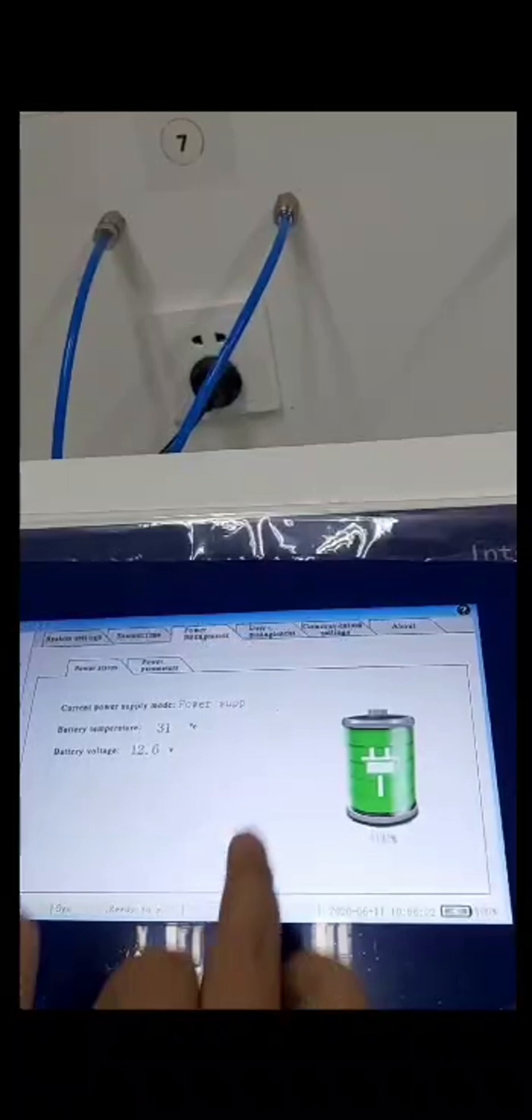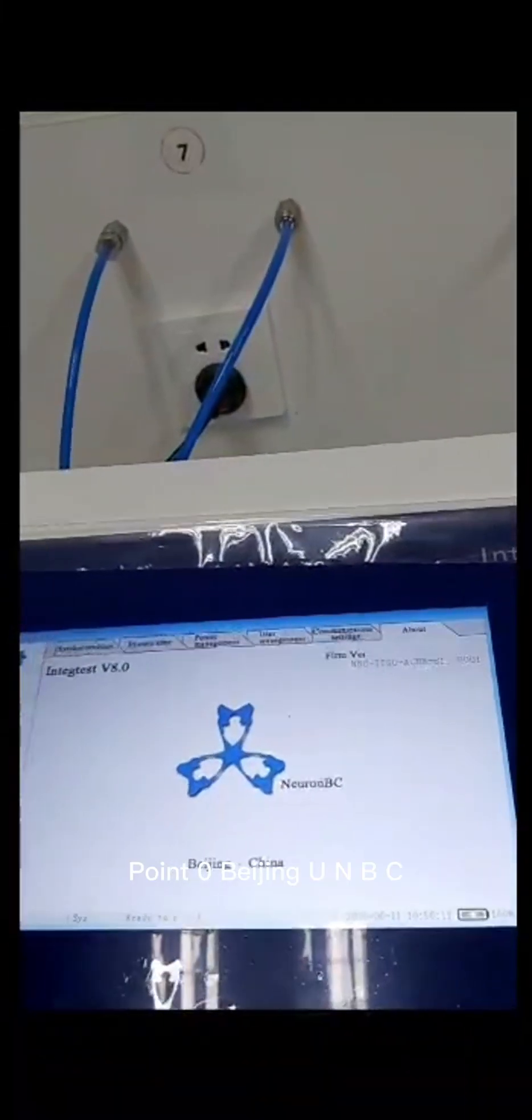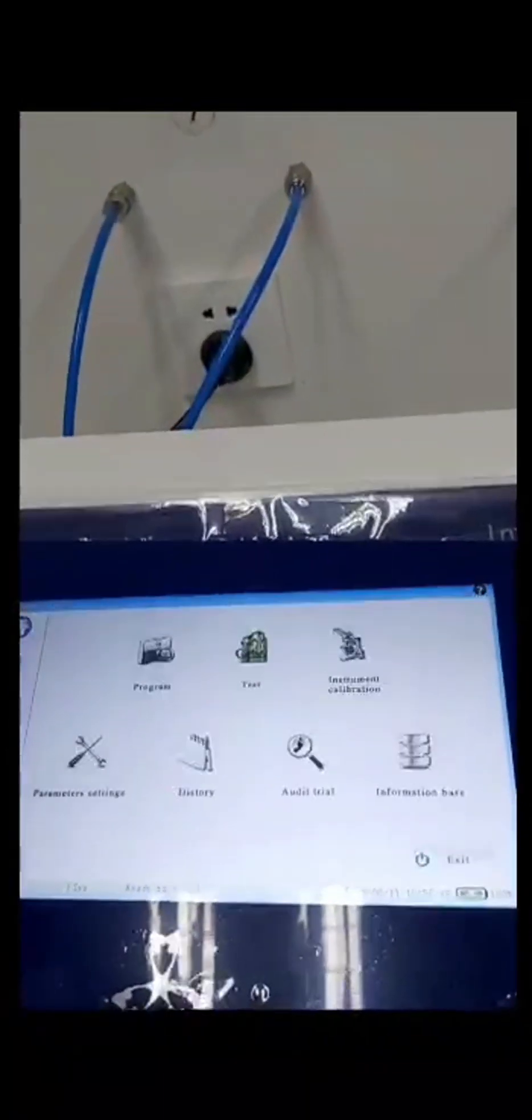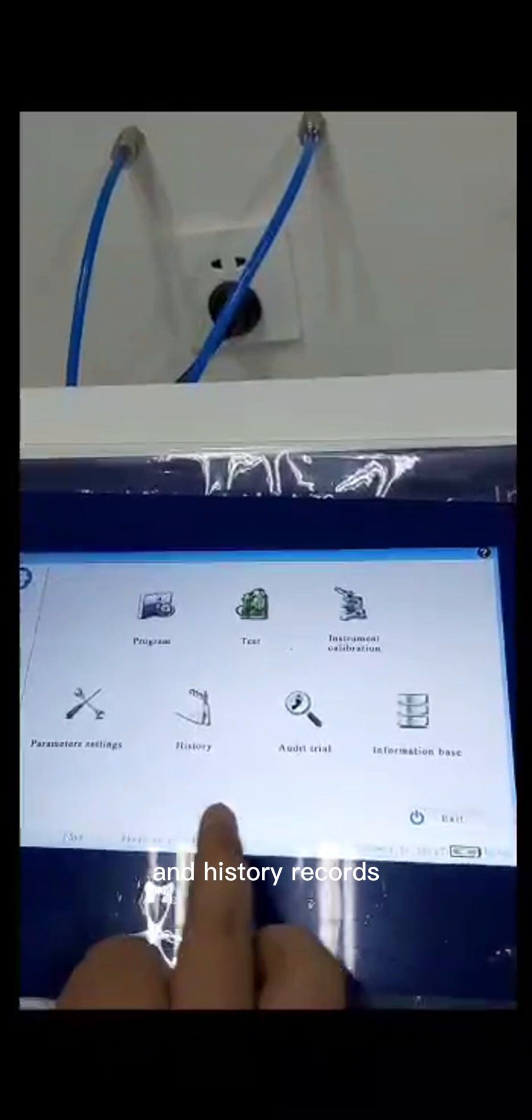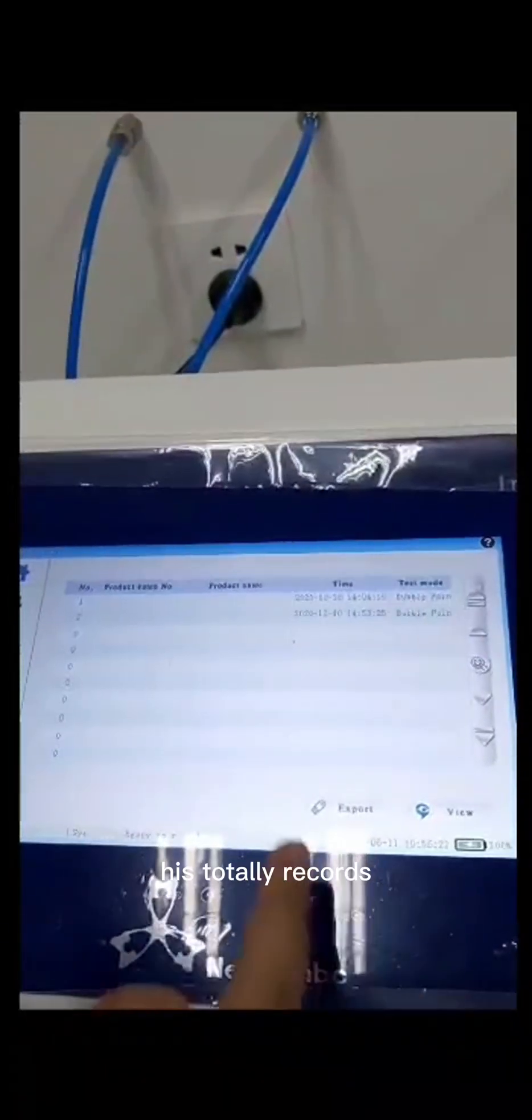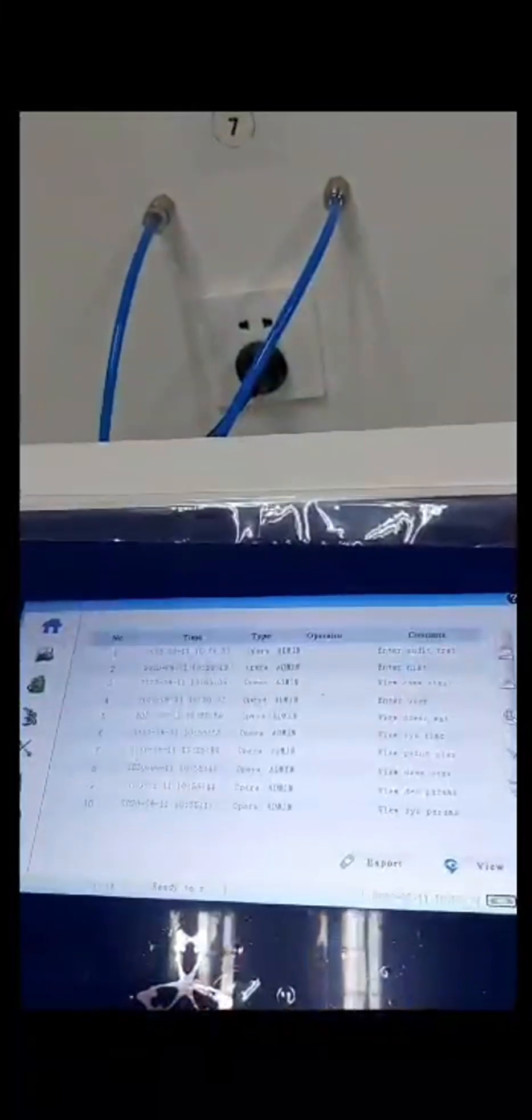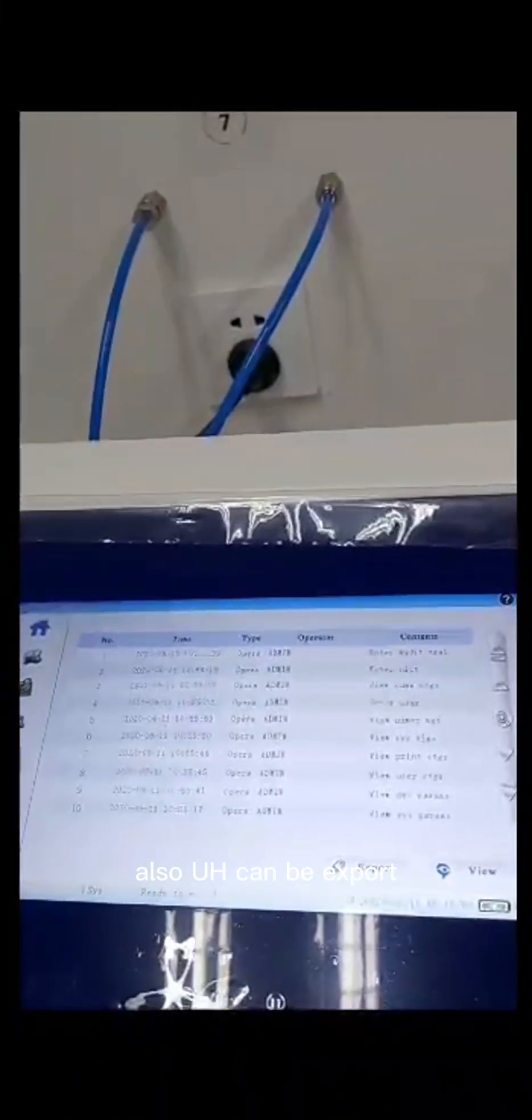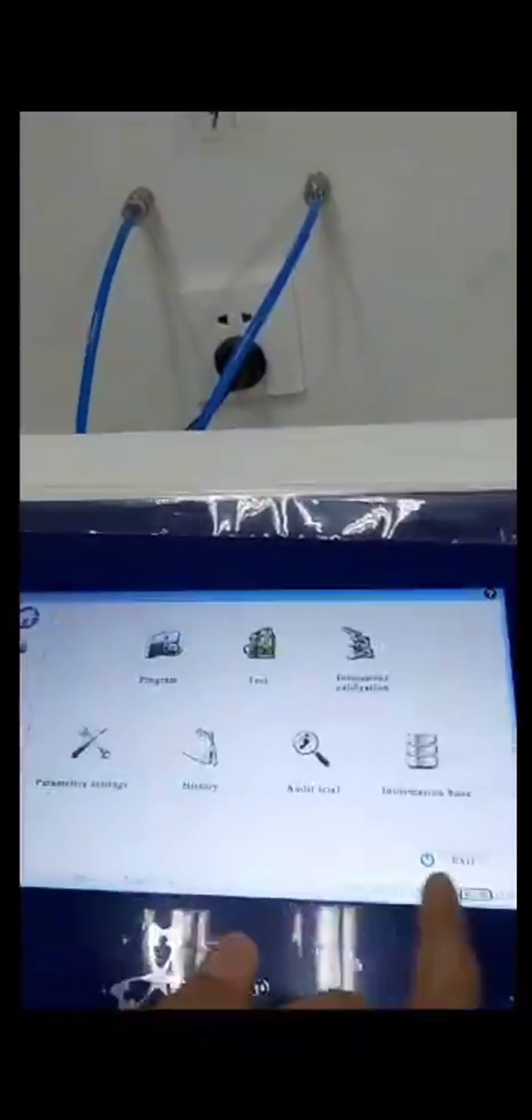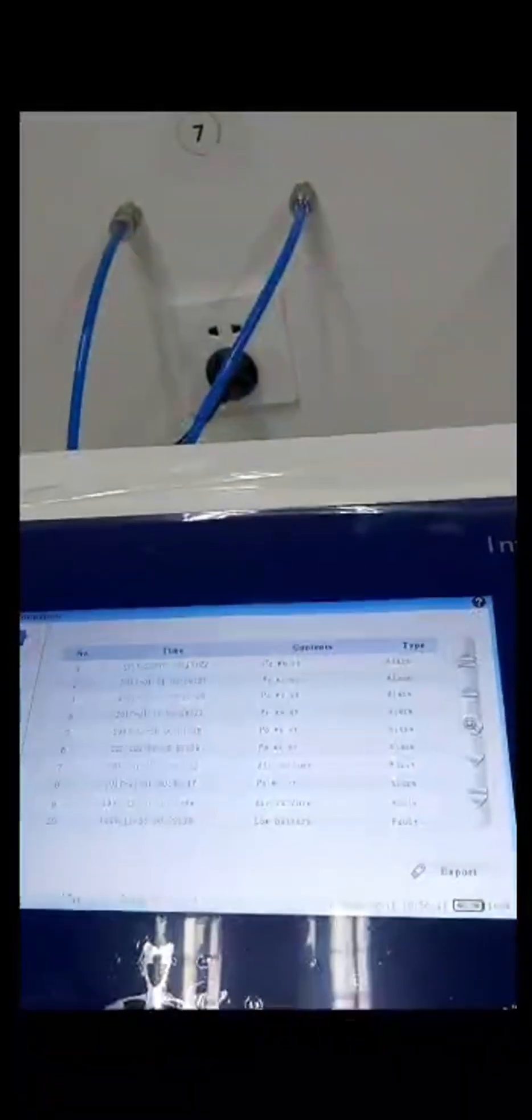For management. User management, communicate, communication settings. About. This is the V8.0, Beijing Neuron BC. History records. History records can be export. Also have the audit trail function. Audit trail function also can be export. Also the information basis. Information basis also can be export.